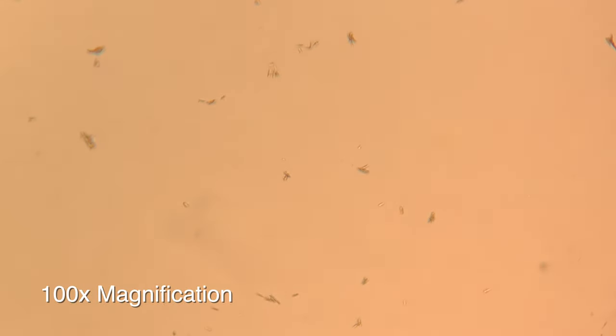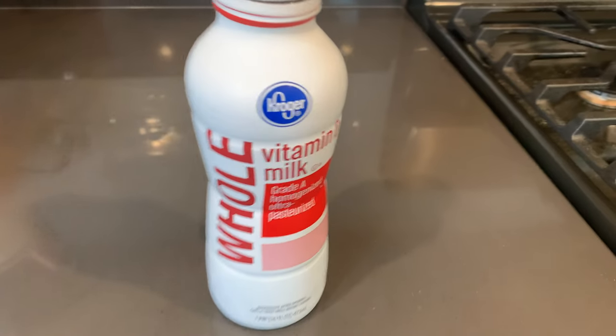Most of what's visible under the microscope is the fat. Now, that's not to say that there's more fat than anything else in milk. In fact, it's quite the opposite. According to the International Dairy Foods Association, most milk is about 87% water and 13% other solids. Whole milk is composed of 3.5% fat. The only reason that we see this fat is because fat is hydrophobic, meaning that it doesn't dissolve in water.